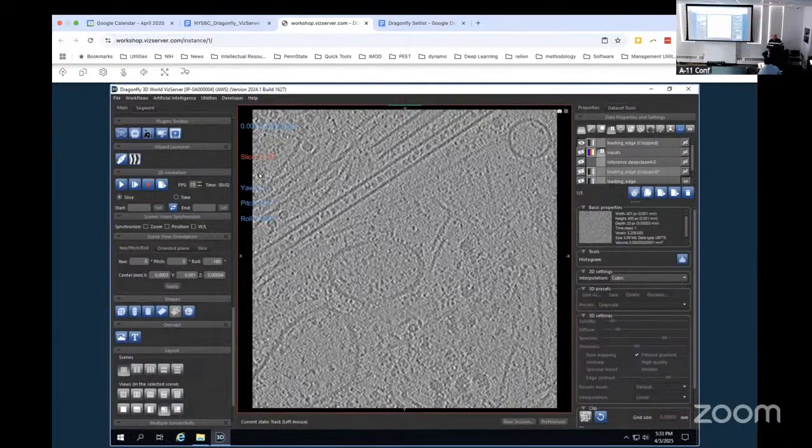All right, so we're going to just talk a little bit about the hand annotation tools. But I hate hand annotating, and I find the easiest way to do it is to denoise your data first, and then use the tools that work well with high signal to extract specific features. And so click on this leading edge.